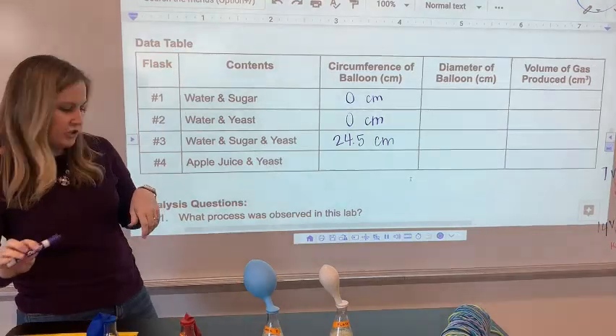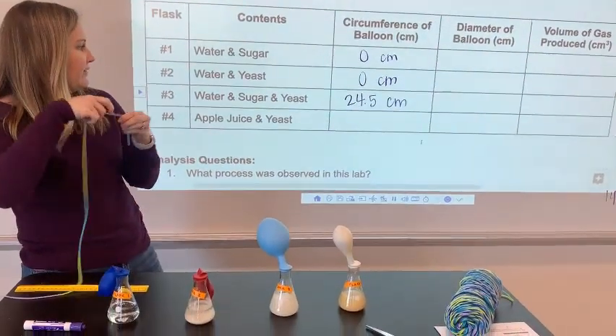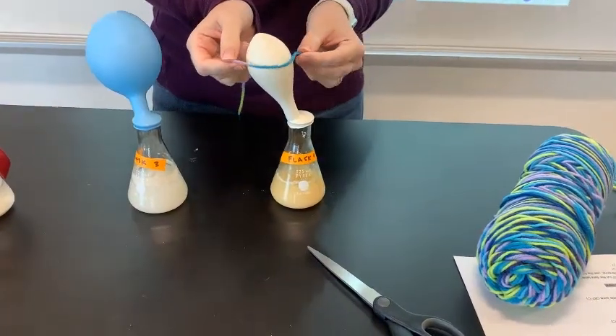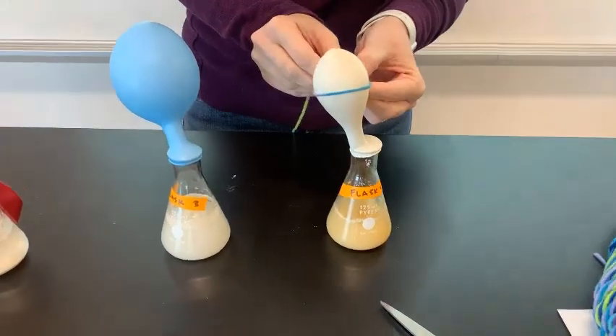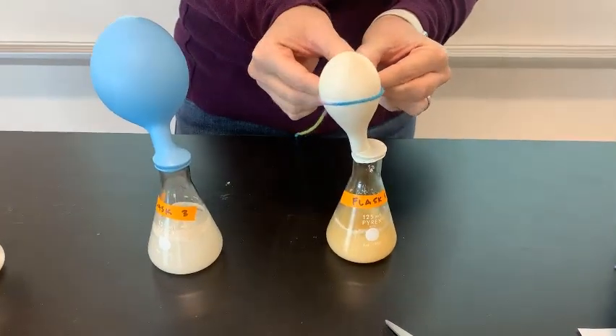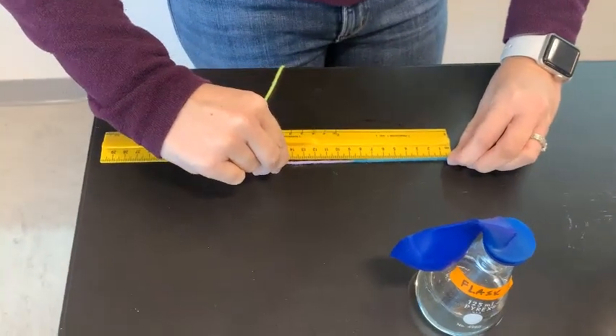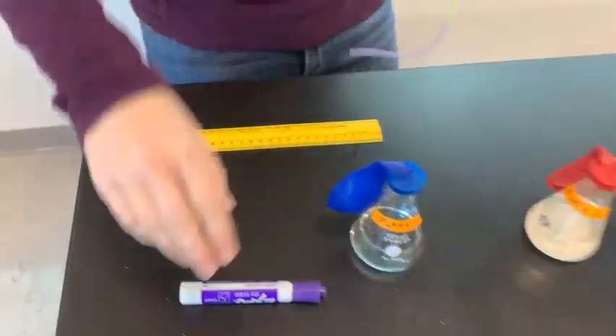Flask three had water, sugar, and yeast in it. Now we look at flask four, which used apple juice and yeast, and definitely some gas was produced — a little less than flask three. When I measure my string it's about 15 centimeters.